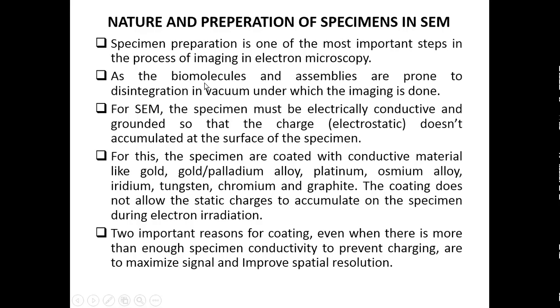Because biomolecules and assemblies are prone to disintegration in vacuum. Actually, all the activities, specimen interactions and so on, are done under a vacuum environment, isn't it? So under this condition, disintegration of the biomolecules and assemblies can take place, and under this vacuum condition only, the imaging is being done. So for that purpose, we have to prepare the specimen accordingly.